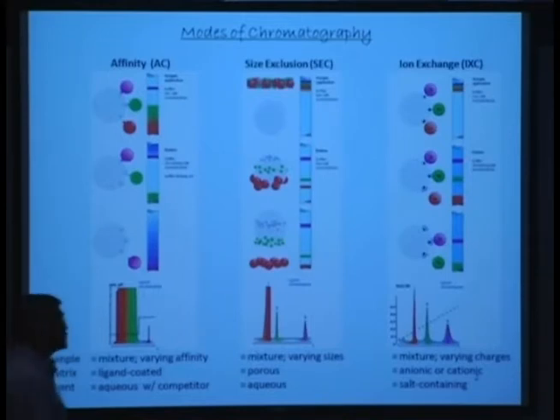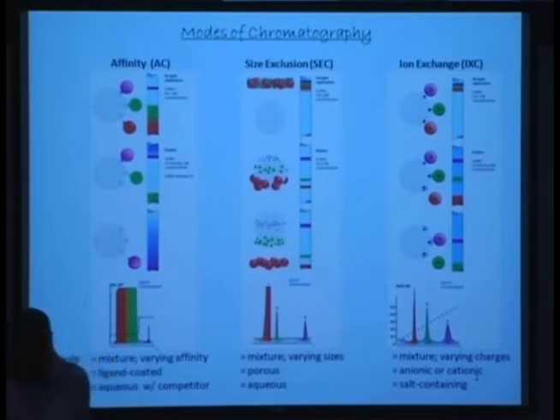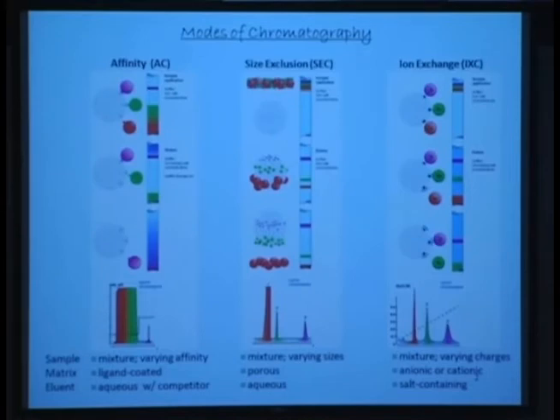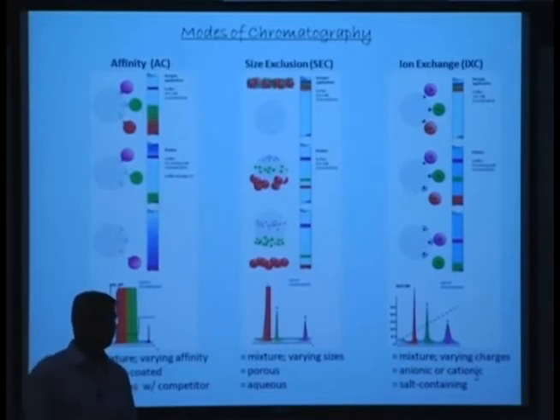Unless you are purifying microgram quantities, if you do several milligram quantities, then you end up with a fairly high concentration of salt, 1 molar or 1.5 molar. And if you have oligosaccharide, not heparin, then that is a significant challenge from the preparative perspective, which I want all of you to understand. And the question is why?